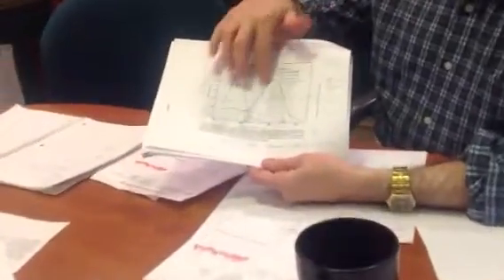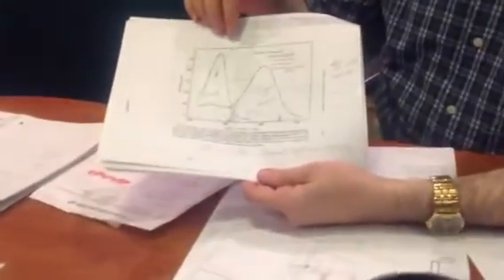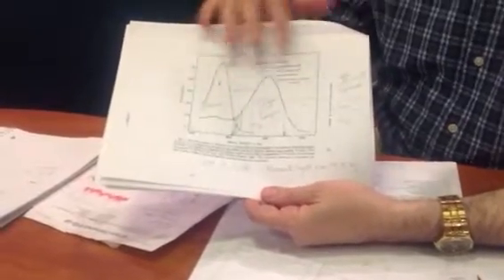The first advance was we repeated, this is from George Wald's classic paper, The Molar Extinction of Rhodopsin from 1953, and I don't know if you can see it. That's only 51 years ago. A spectrum of rhodopsin. After rhodopsin is bleached by light, you see a drop in this particular peak. Of course, this is purified protein.